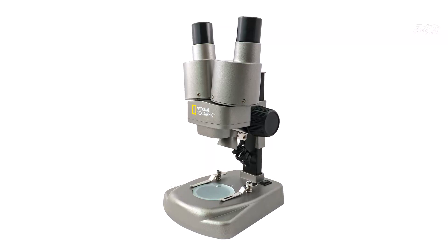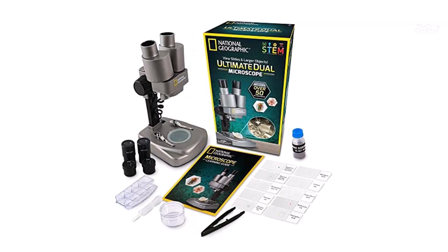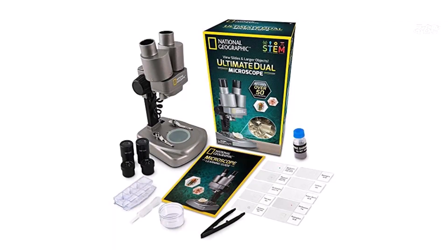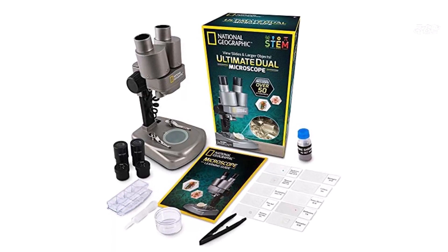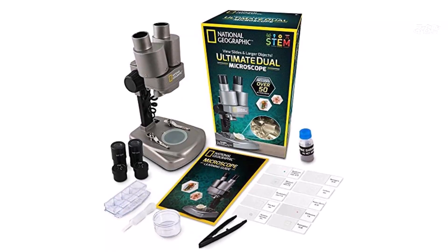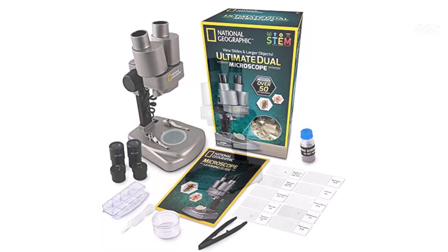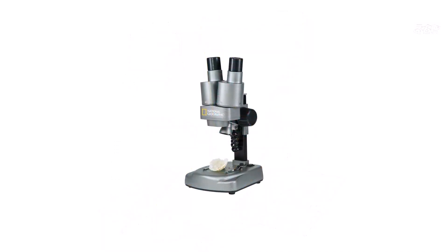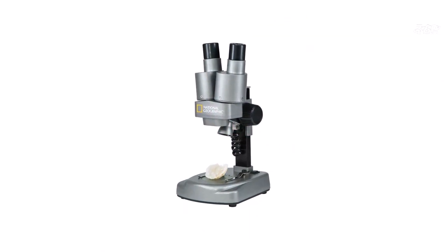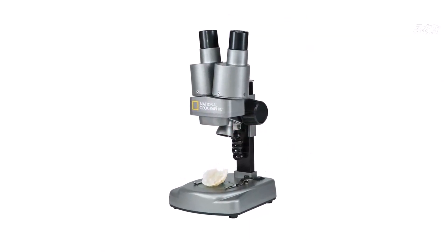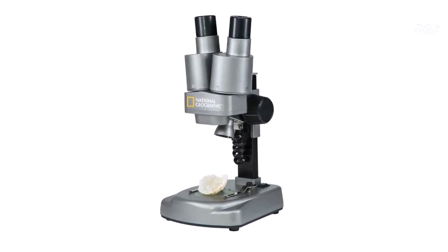This microscope comes with over 50 accessories, making it a complete kit for scientific exploration. The package includes a curated set of 10 prepared slides showcasing a variety of biological specimens. Additionally, it provides blank slides, covers, tweezers, and an eyedropper, allowing children to create their own slides and conduct personalized experiments. The inclusion of a petri dish for plant labs and a mini geode adds further excitement and educational opportunities.